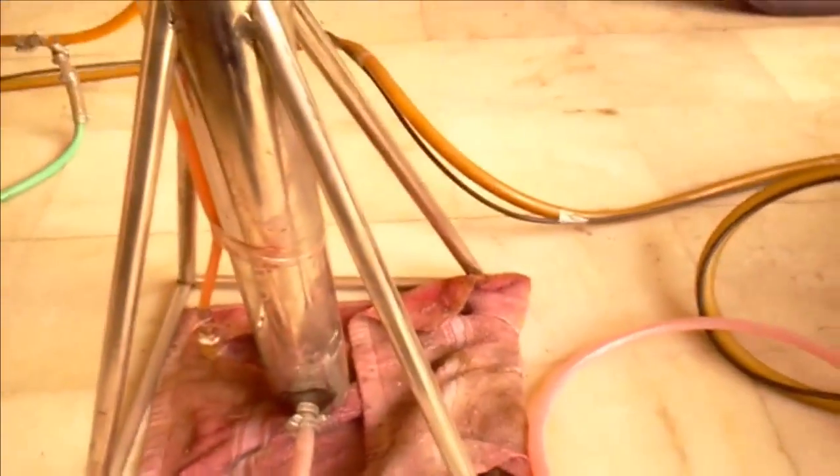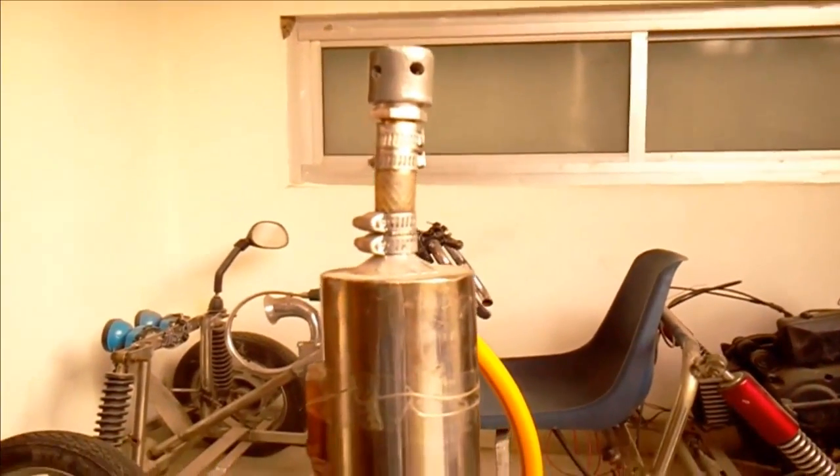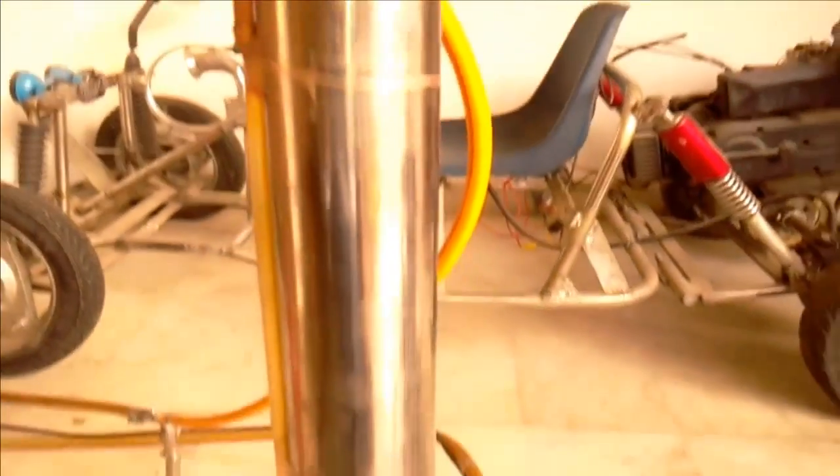I am using my previous bubbler that I have for hydrogen production by electrolysis.